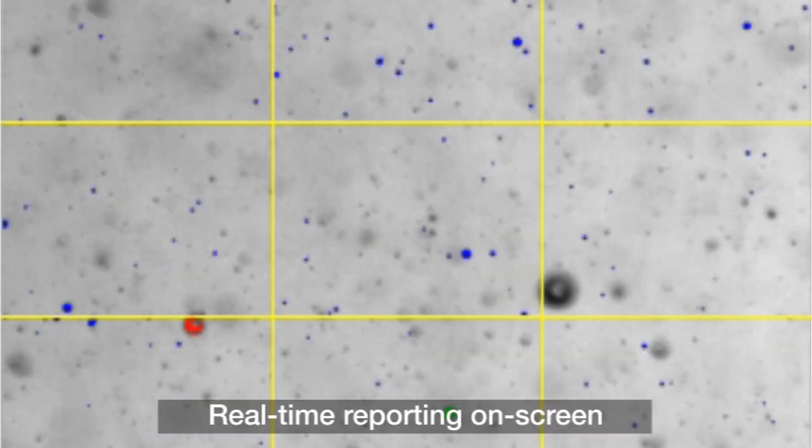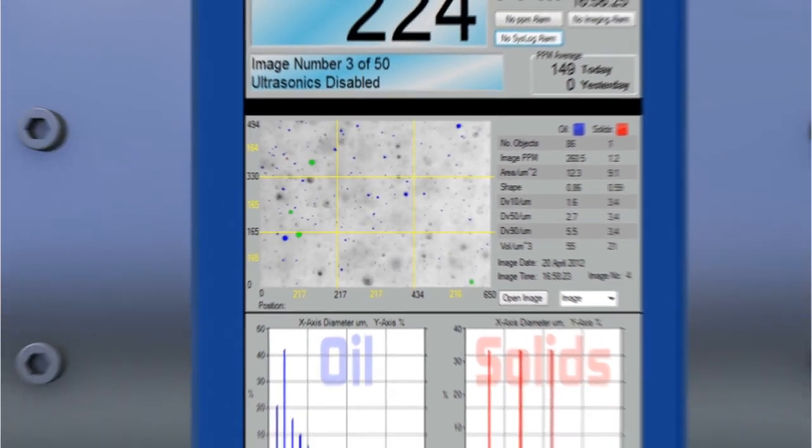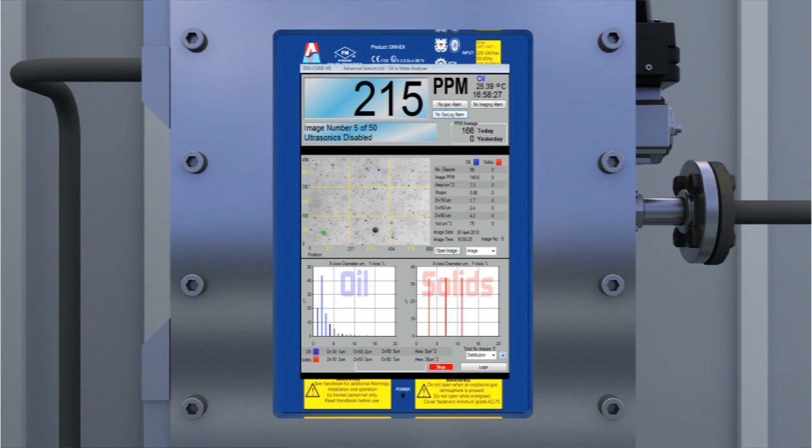As this process progresses, an accurate, detailed dataset builds and a clear picture of the water content becomes evident. All data is reported on the analyzer screen, along with the fluorescent PPM measurement.